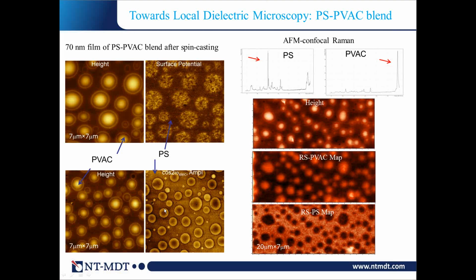And indeed, what we found, and that's established knowledge now, is that in the case of surface potential, we measure it practically directly, if not taking into account the contamination of tip and sample. In many cases on the same material, these differences in the surface potential are a pretty good direct number. For example, in metals, we found that the difference of potential is directly related to the difference of work functions. That means it's a direct measurement. Surface potential is probably the only method related to AFM that gives direct measurements.